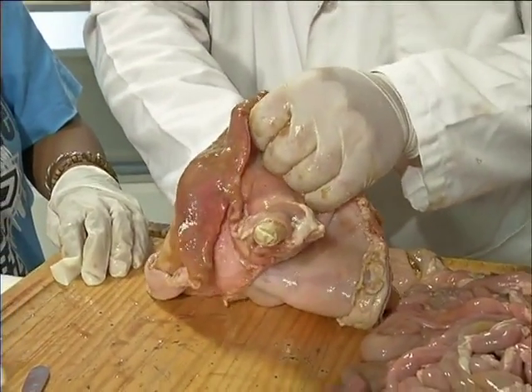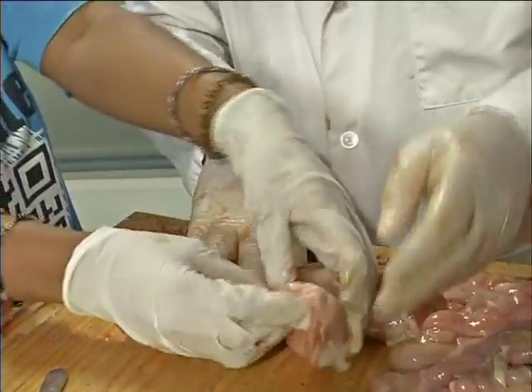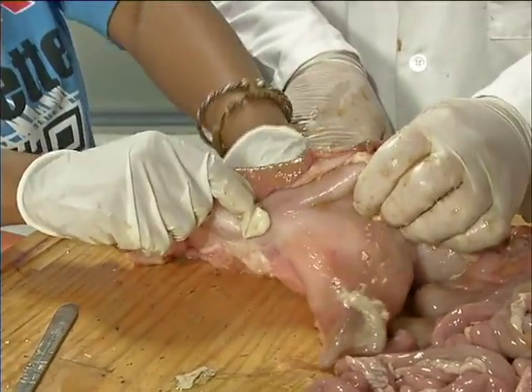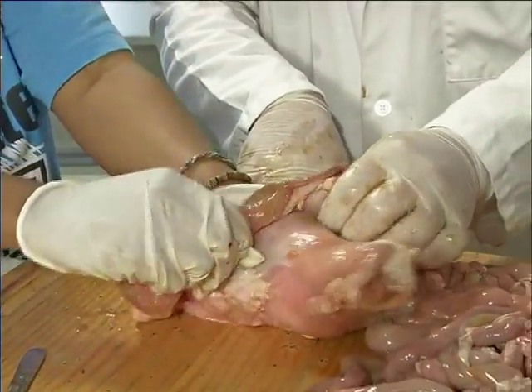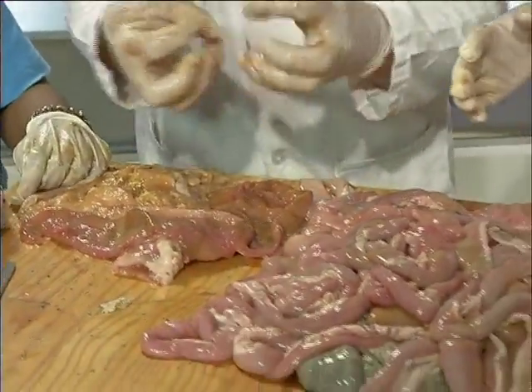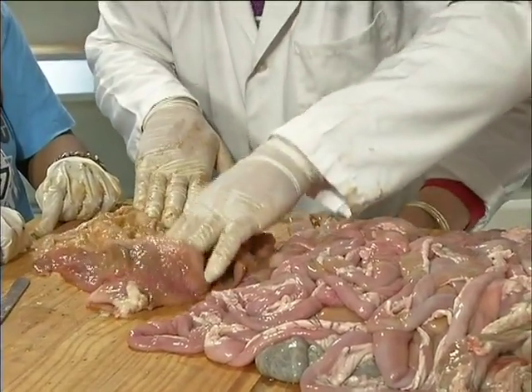Right? Now, if you have a look, Looney, look how nice and big that feels. Yes. Feel this muscle here. Stick your finger in there. Feel how tight it feels. You can only stick a finger in, hey? Yes. Even though it looks nice and big, you can't stick your whole hand in because it's nice and tight. That muscle actually holds it. Right. So that there is your stomach.